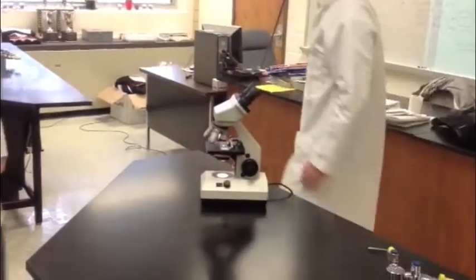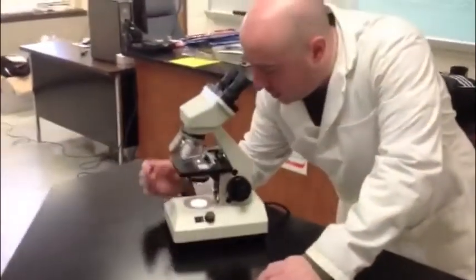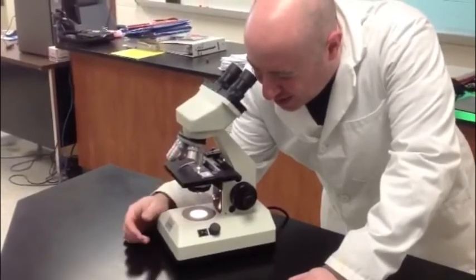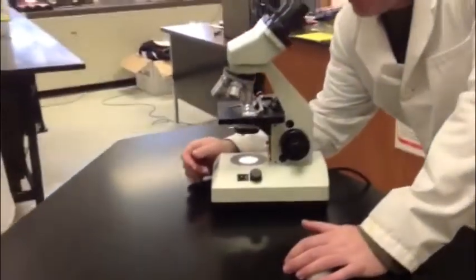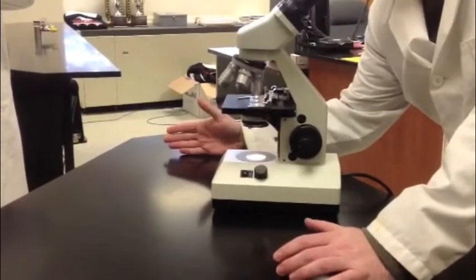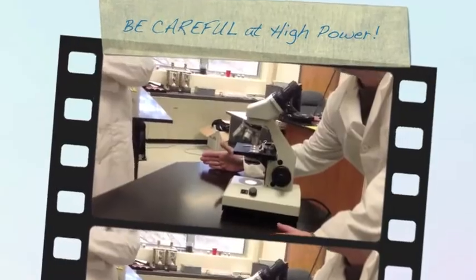Hey, it's all black. Well, one of the things you've got to do when you switch between powers is you need to make sure that the next lens actually locks and clicks into place so that it's there. The second thing you need to make sure is that you don't just skip powers. You can't go from scanning all the way to high power. You have to go from scanning to low power and then high power, focusing on each one along the way.